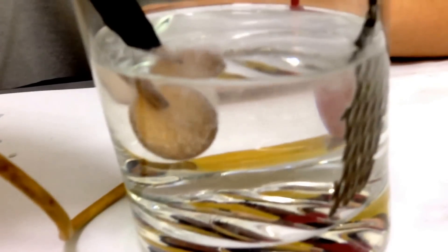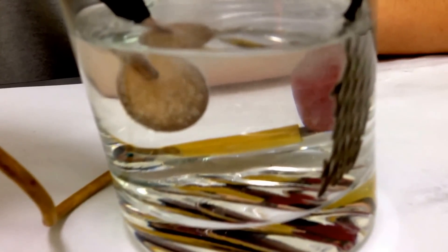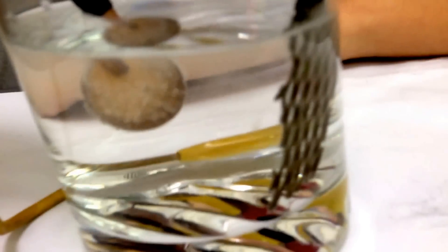The anode is a platinized titanium. At the anode, we have hydroxyl ions discharging, and when the hydroxyl ion discharges, oxygen is formed at the anode, which is a platinized titanium. And at the cathode, which is the coin, both gold and hydrogen will form.